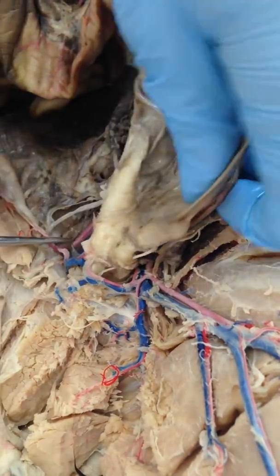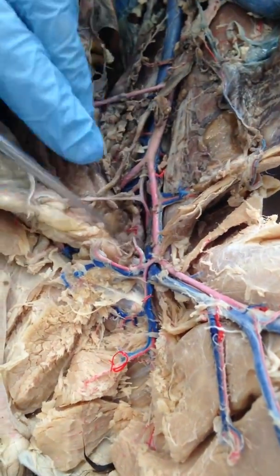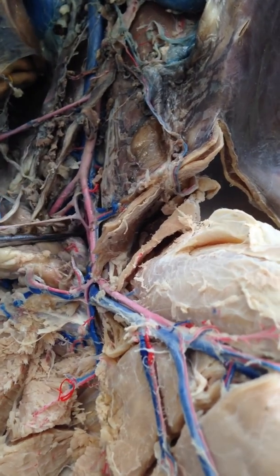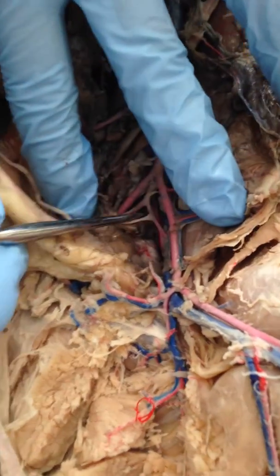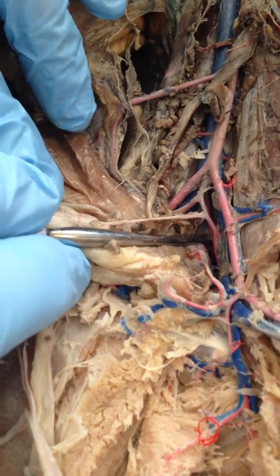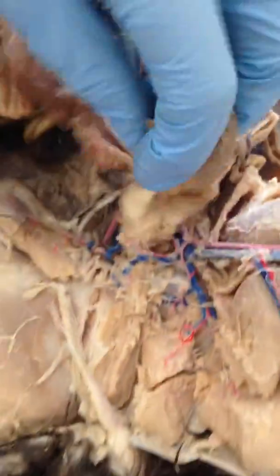Okay. Do we have to find the caudal too? It's in there. The way to find the caudal is just right from... coming straight, the caudal's right there. It comes straight off this branch of the internal iliac, so way down here is the caudal artery, vein, way on the inside.